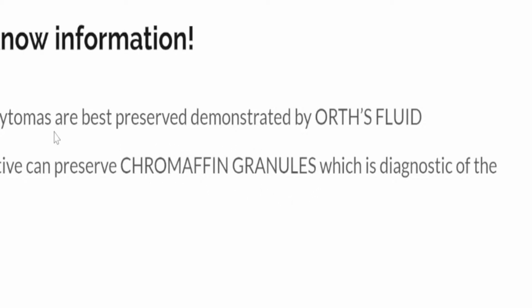And the best fixative to demonstrate chromaffin granules is Orth's fluid. So always put this in mind. Pheochromocytoma, chromaffin granules. Chromaffin granules are best preserved with Orth's fluid. Those are the things that I want you guys to remember if that is going to be part of the board exam.